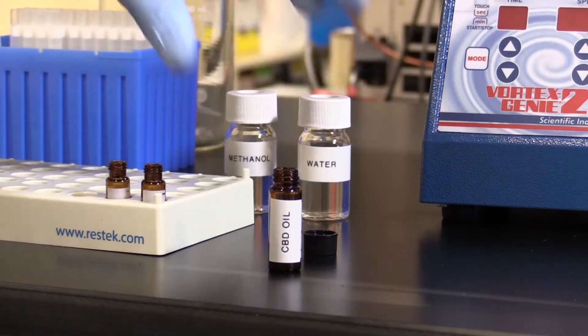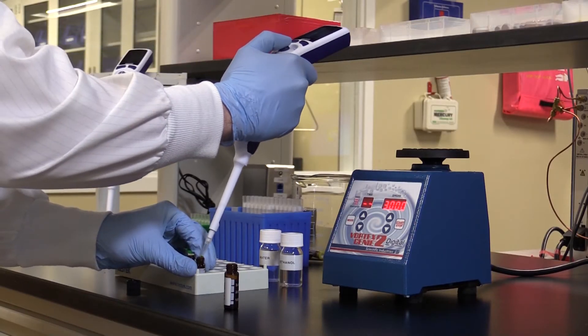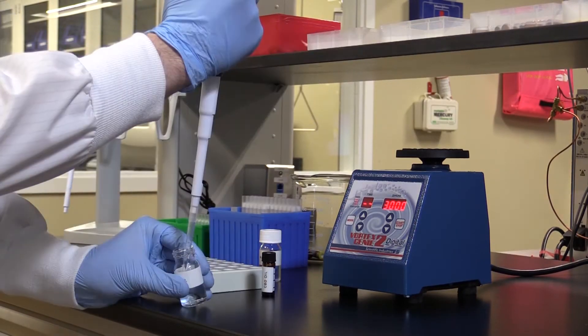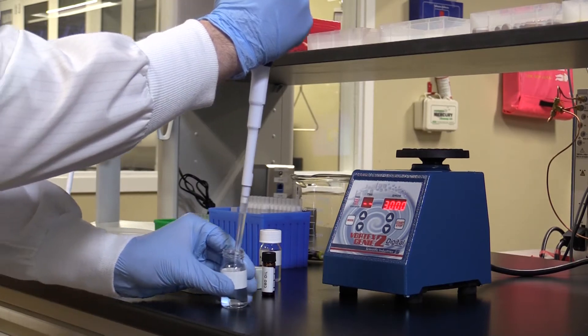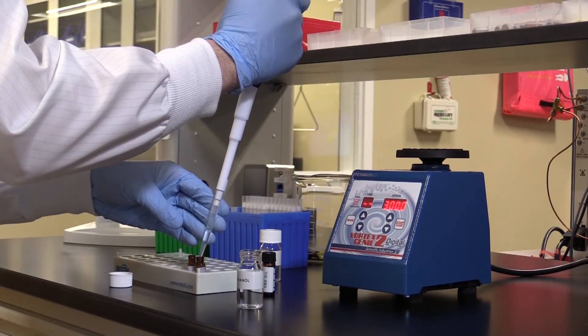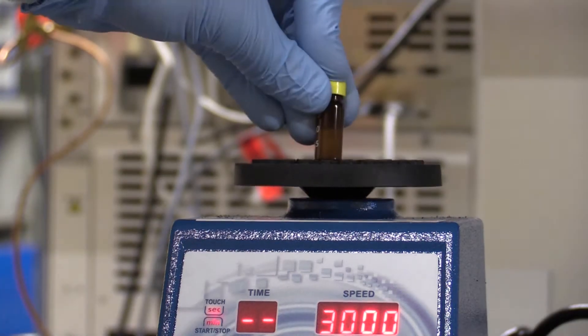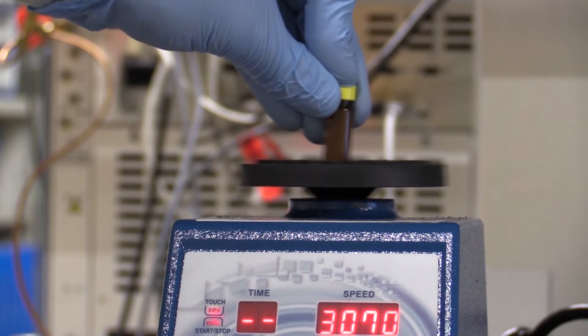Our first step is to pipette 50 microliters of CBD oil and then extract the sample with 950 microliters of methanol, followed by vortexing for 30 seconds at 3000 rpm.